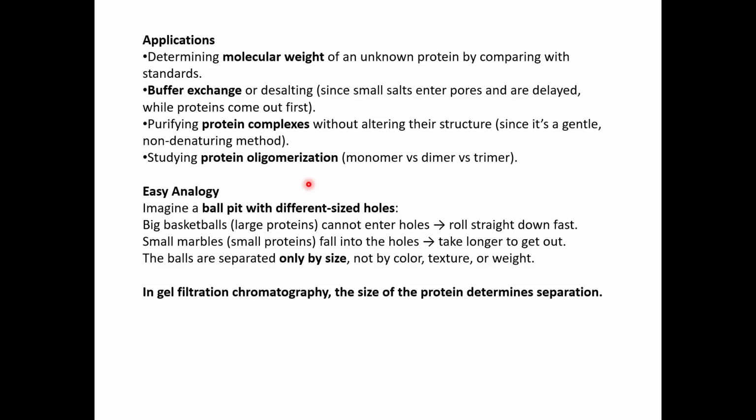Then to explain in simple words, this is an example or an analogy. You can imagine a ball pit with different sized holes. Big basketballs are like larger proteins that cannot enter the holes, and they just roll down fast.